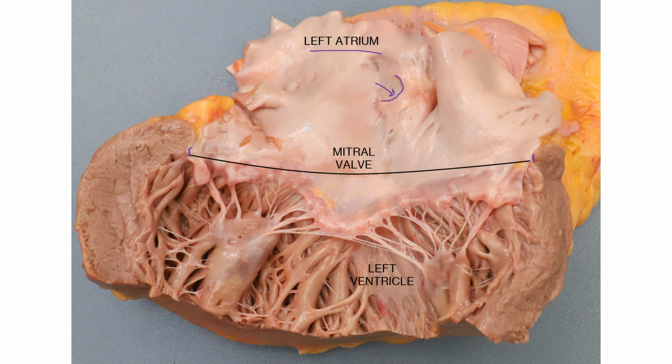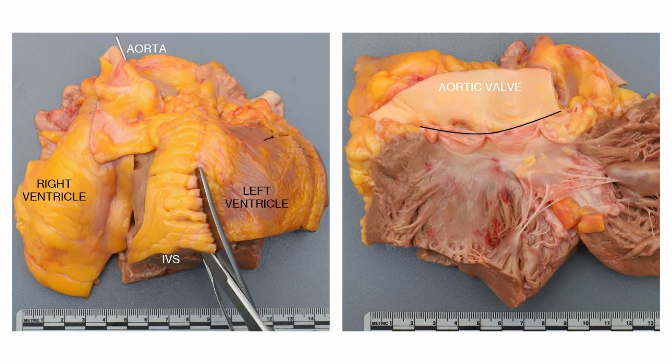Okay, and now lastly, again, back to that anterior surface. You can see my cut here when we went from the right ventricle to the pulmonary. Now we're going from the left ventricle into the aorta. So again, we're being mindful of that septum. We are going anteriorly and parallel to the septum into the aorta. You're going to have to do a slight curve cut, because you can see the folded over pulmonary valve here, and we don't want to cut into that again.